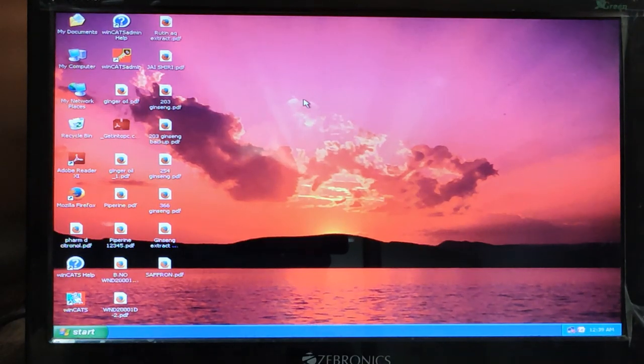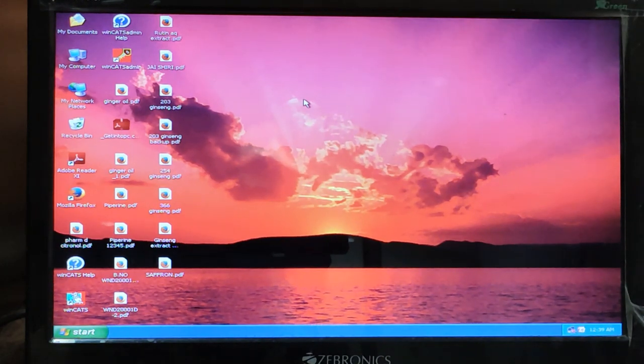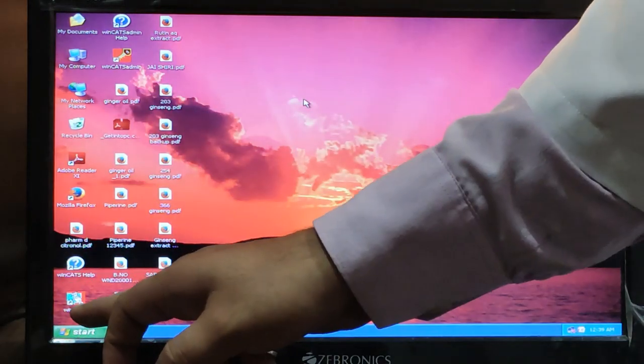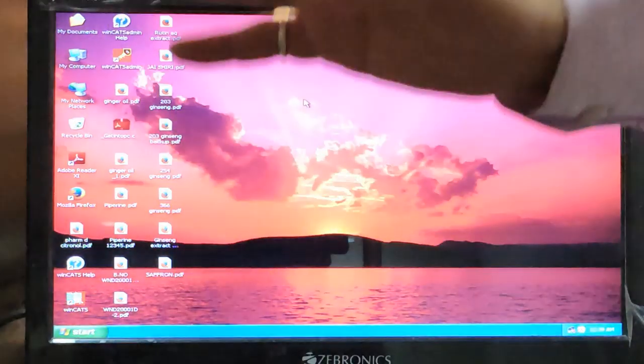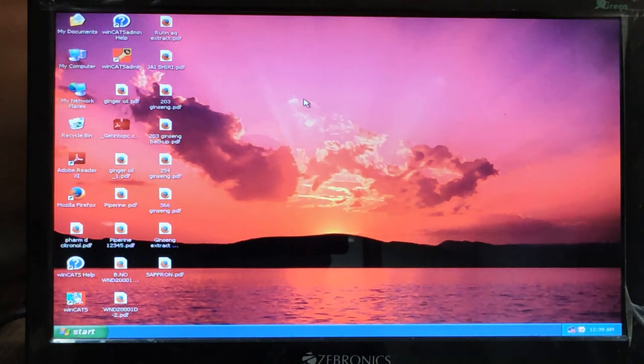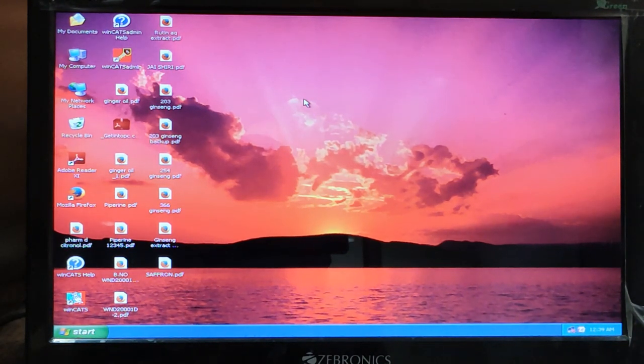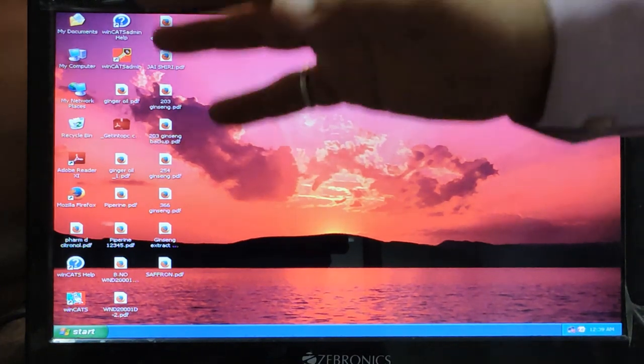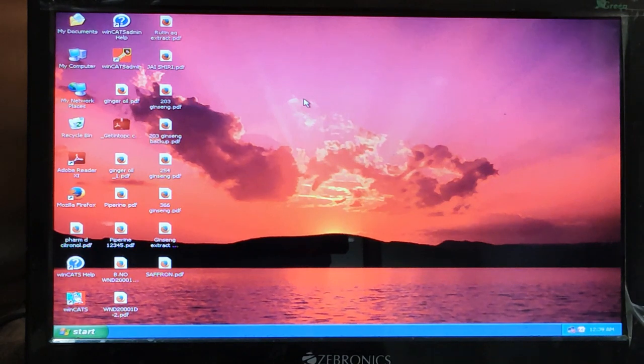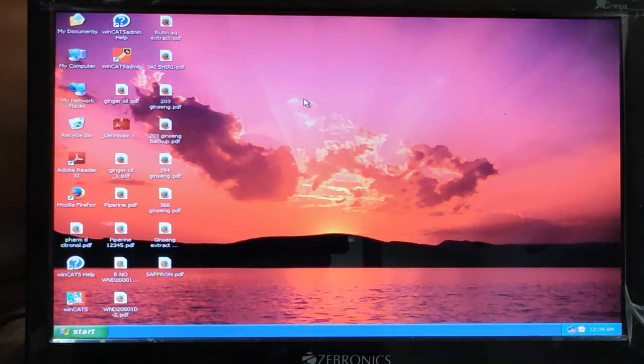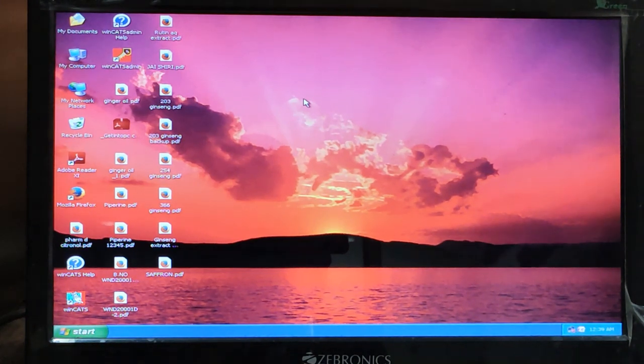So here, we can get the fingerprinting profile of the drug. As I discussed earlier, this machine has a software part also. The name of software is WinCat. This software is connected with sample injector, scanner, TLC scanner and visualizer. With the help of this software, you can give the command automatically. The sample injector will run. So let's see what is the function and how this software works.